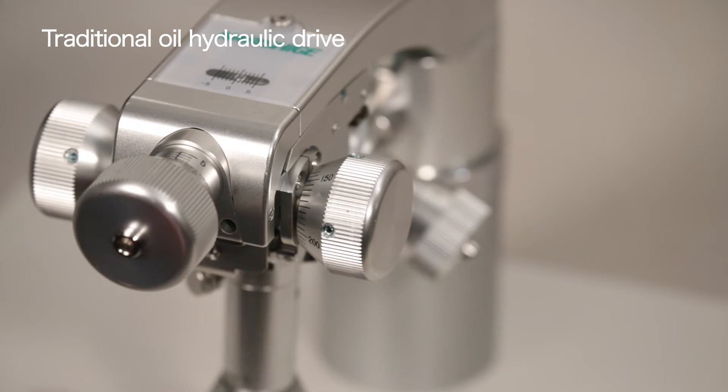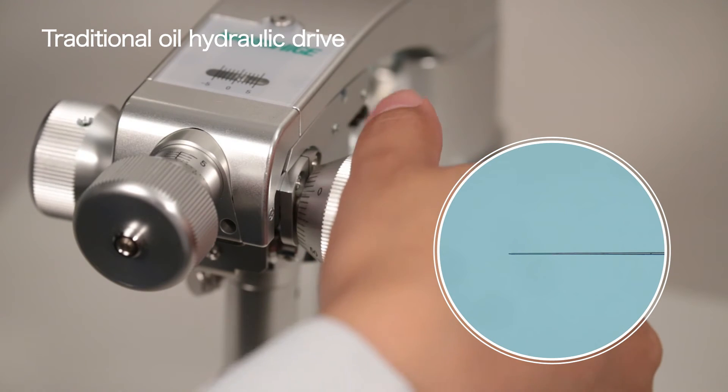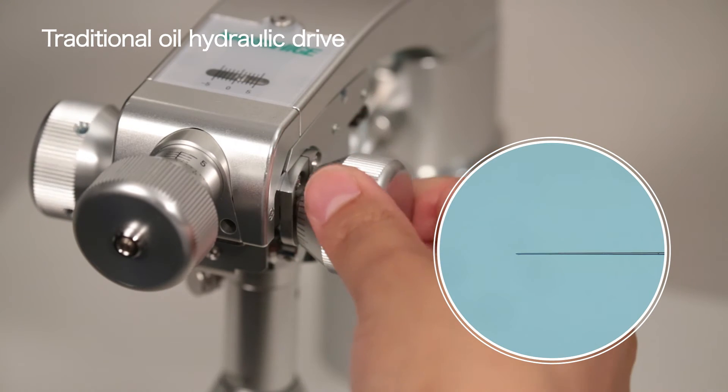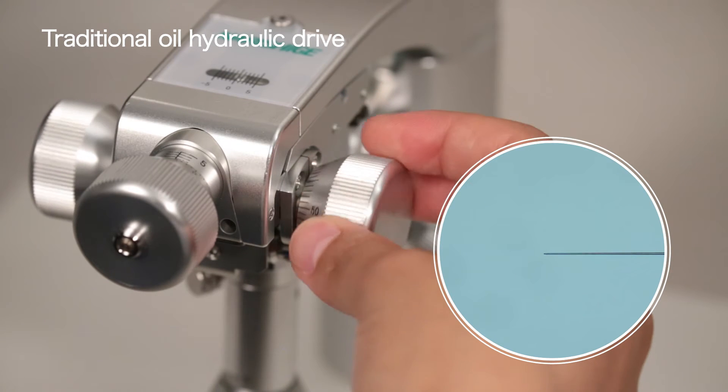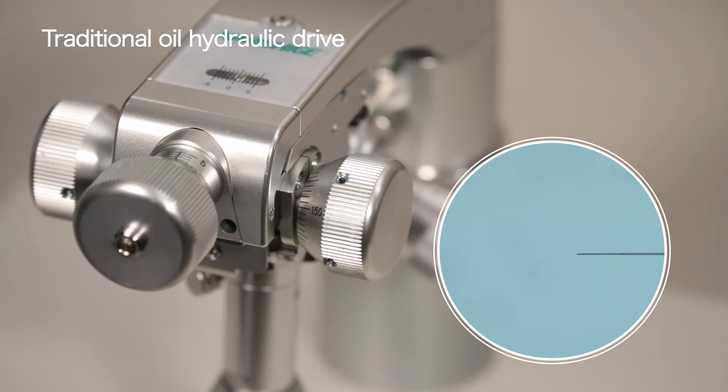The X-axis knob for precise straight line movement enables fine control for puncturing a fixed target. Only the Narishige oil hydraulic drive can perform both of these operations without switching.